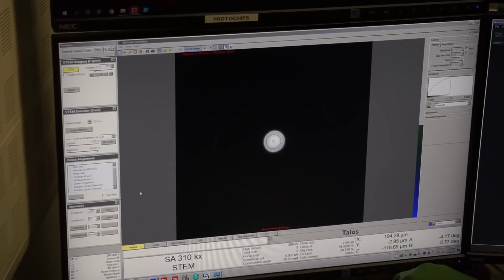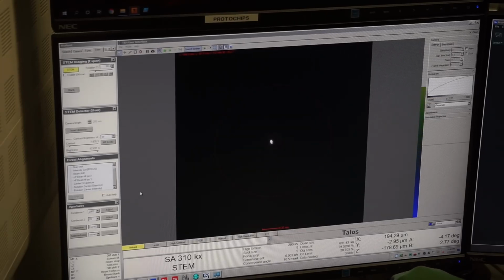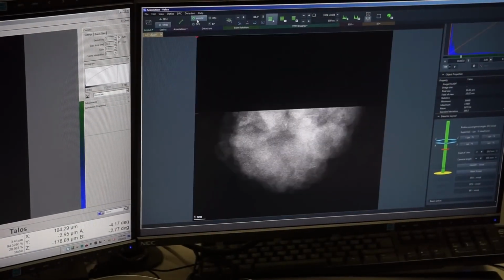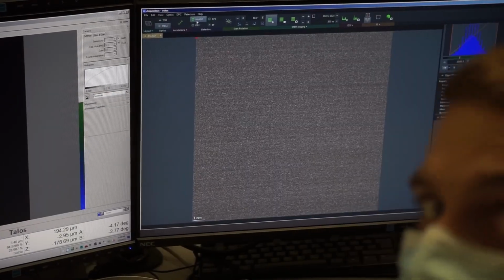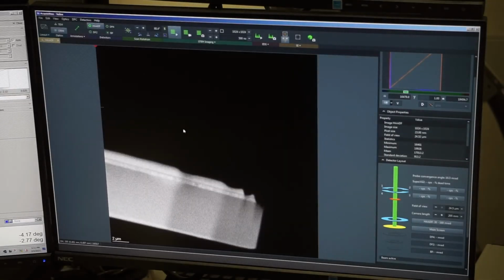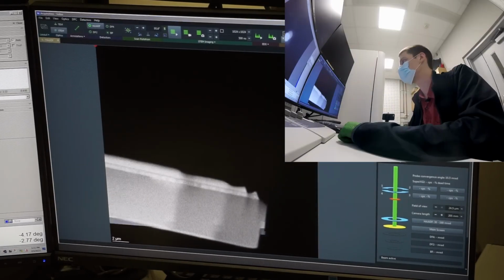And there we go. Now when we focus, we have a nice even beam. It gets really small. Still a little bit of stig. Let's see. And go over here to STEM. And now we're scanning. It's exciting. Got to zoom out a little bit, and hopefully we will see the sample. There we go. Spin the scan around a little bit and get it flat.